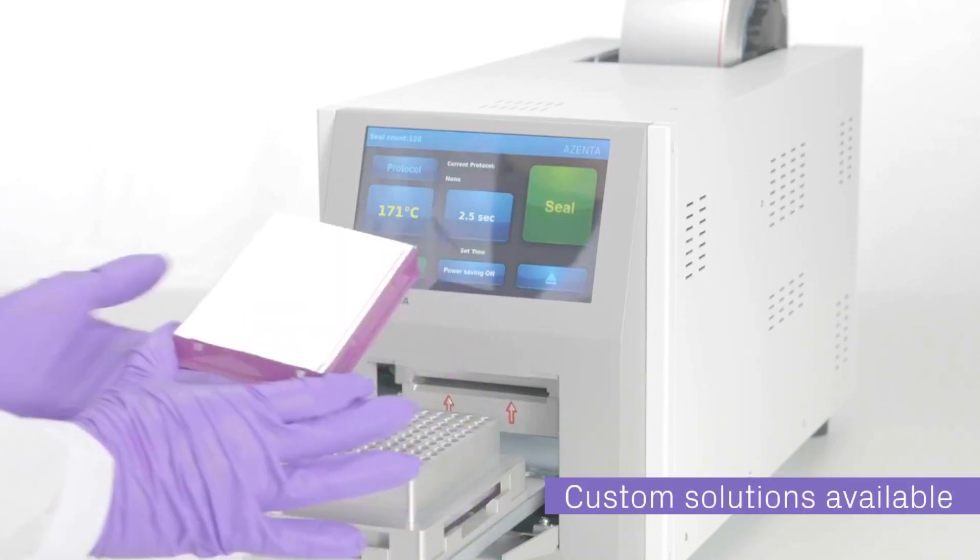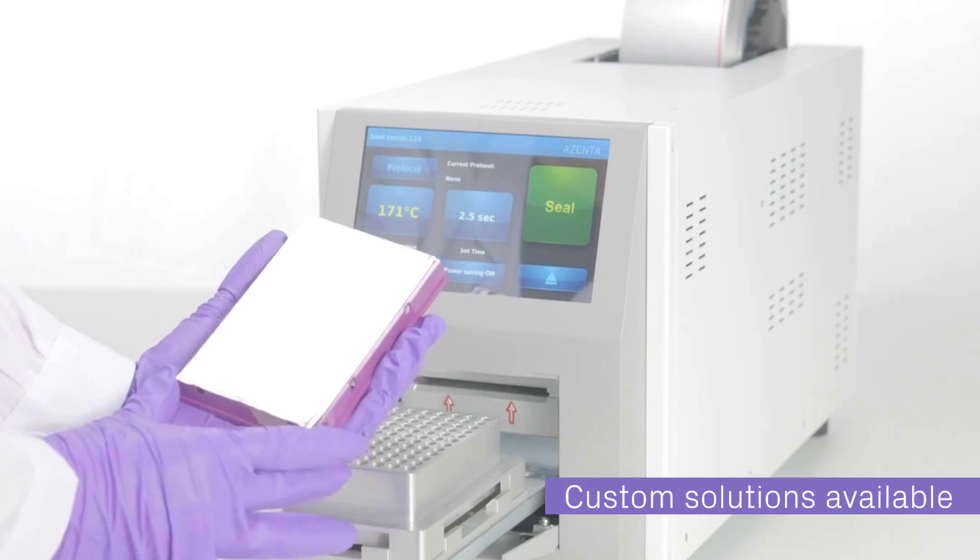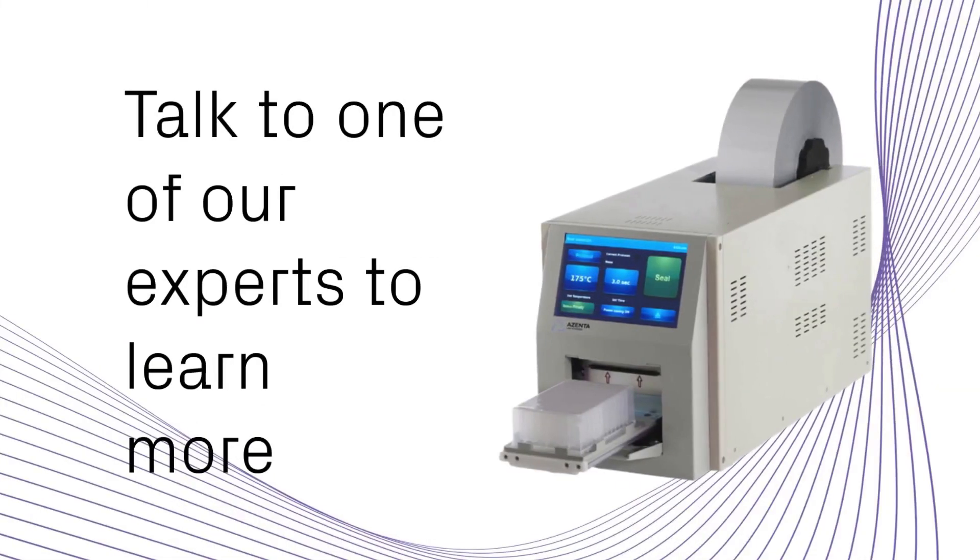Elevate your laboratory's productivity and reliability with the automated roll heat sealer from Azenta Life Sciences. Discover more at azenta.com and request a demo or quote today.